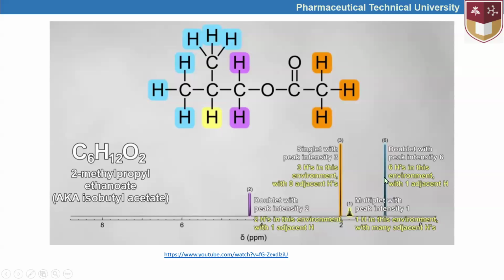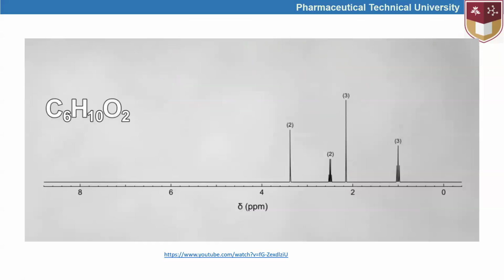Okay, so this is one of the simple structures to develop our ability to analyze and identify the structure of compounds. Now we are going to see another good example in order to strengthen our understanding. Again, here we have a compound with the ratio of elements carbon 6, hydrogen 10, and oxygen 2.